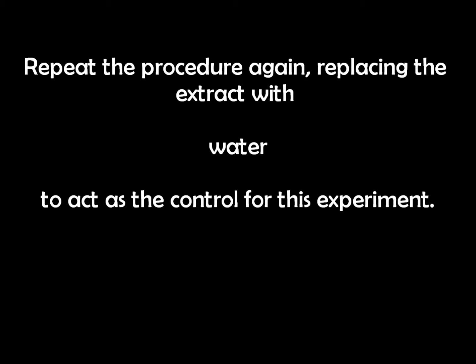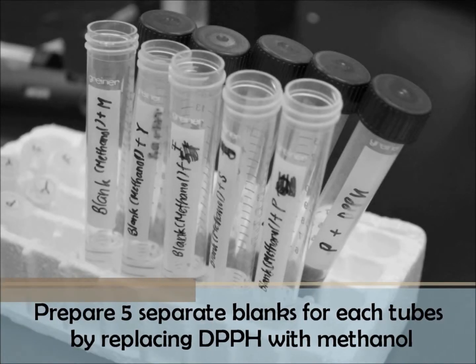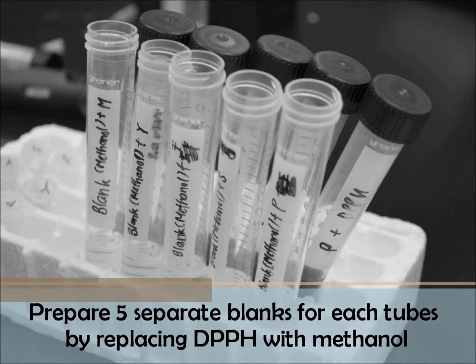Repeat the procedure again, replacing the extract with water to act as the control for this experiment. You only need to do this once. Prepare 5 separate blanks for each tube by replacing DPPH with methanol.